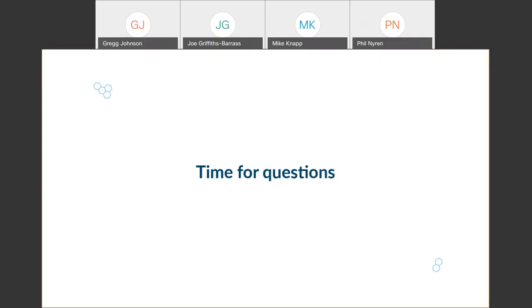Thank you for that. And is there any software for the flow pressure sensors? The ones that produce a log of your process, documenting changes in flow and pressure. Yes, and I think the reference I made was specifically to the ultrasonic controller, which is the actual controller itself, the box. It has an SD card that you can collect the flow rate data over time, and I think it's like 32 gigabytes. It's a significant amount of memory.